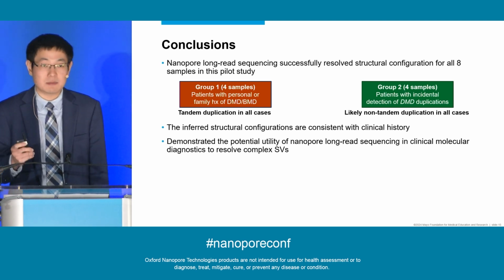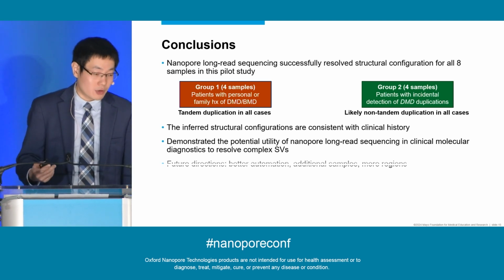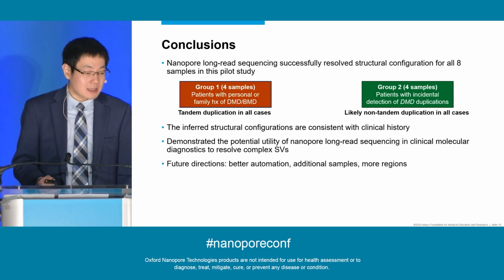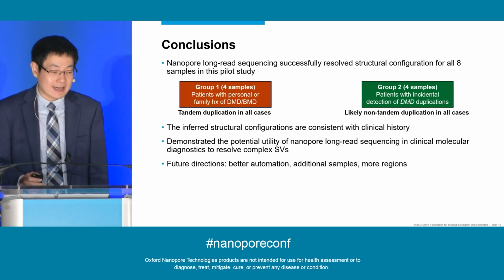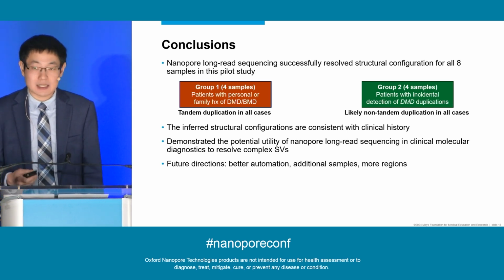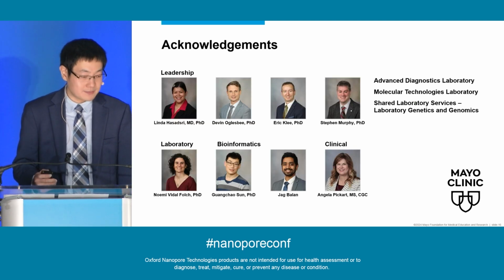We expect them to be in tandem for group 1, and we have no expectation for group 2. This study demonstrated the potential utility of nanopore long-read sequencing in clinical molecular diagnostics to resolve these complex structural variants and be able to clarify its clinical significance.